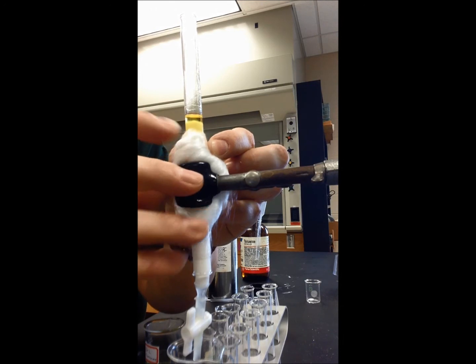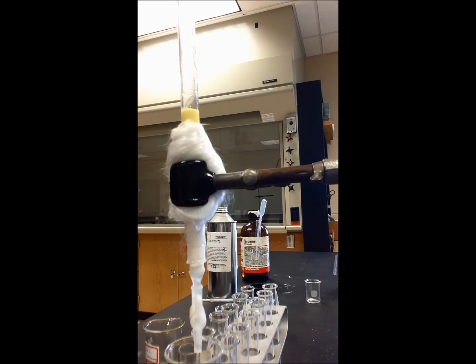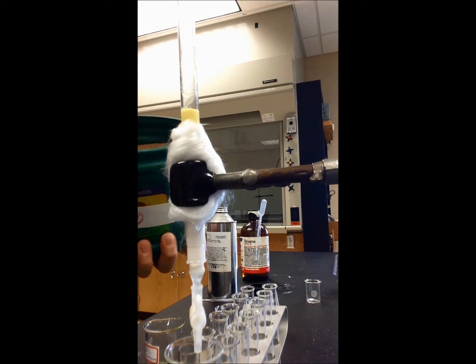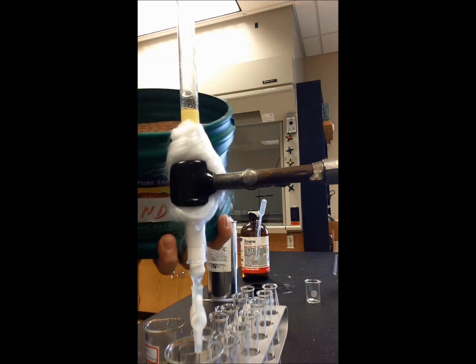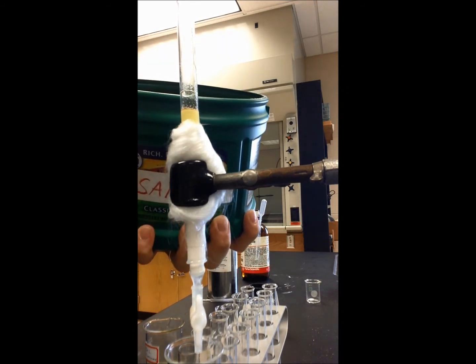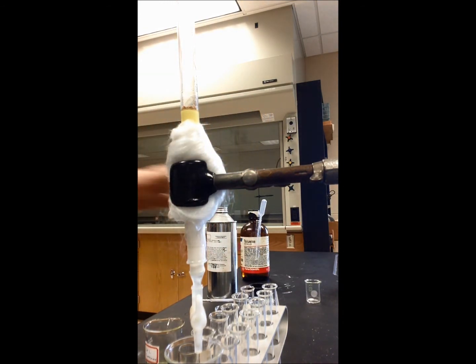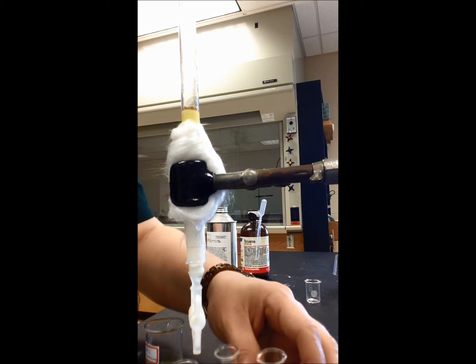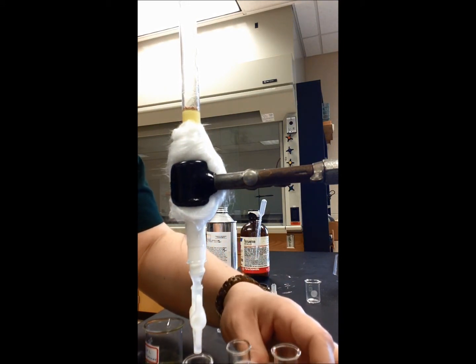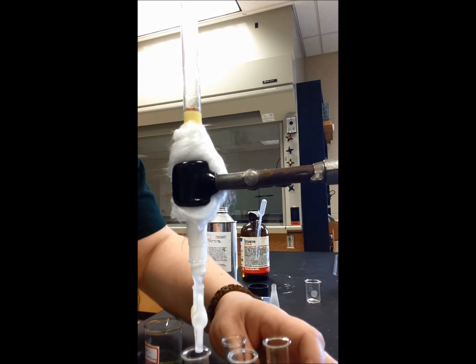I'm going to wait and drain off the alumina again until it just touches the top. Then I'm going to add just a little bit of sand. Now I'm ready to start collecting my fractions — I'm going to line it up into that first collection vessel.